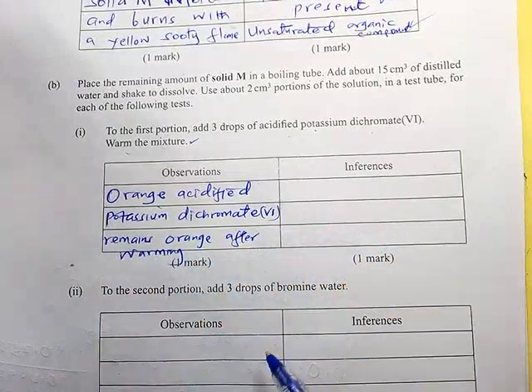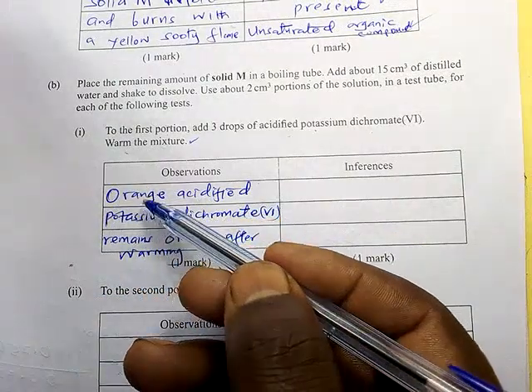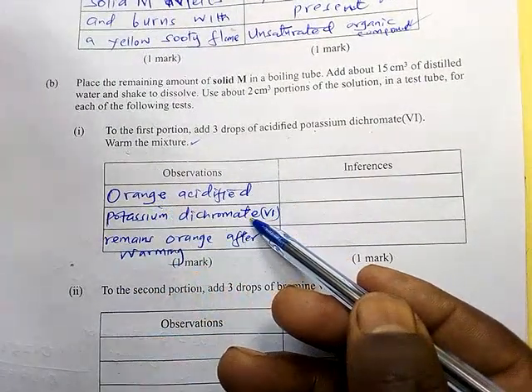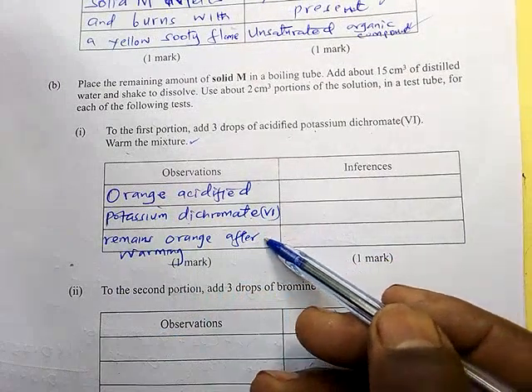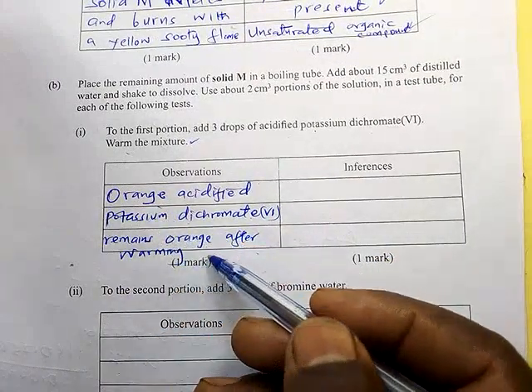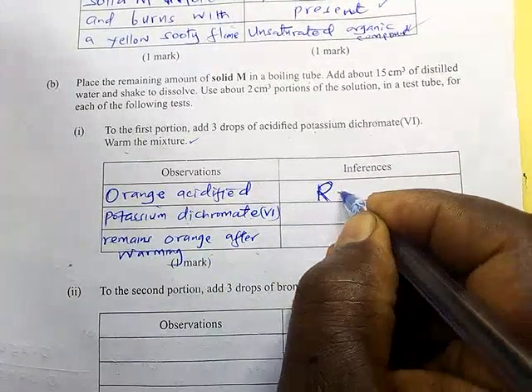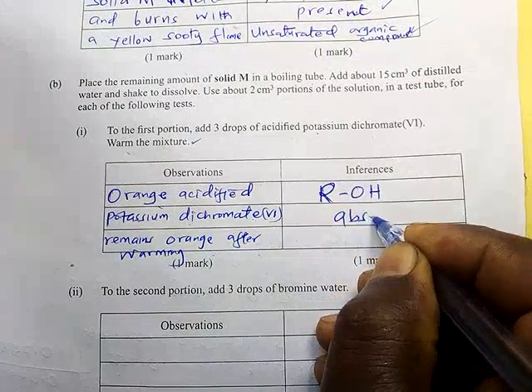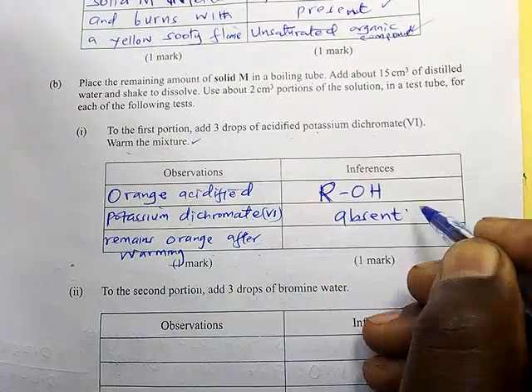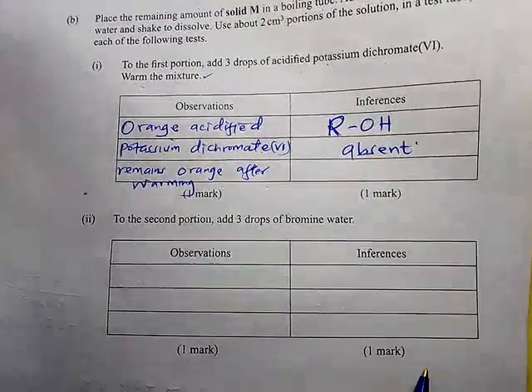So the color did not change. We expected it to change from orange to green, indicating that there is an alcohol. But it did not change, therefore it remained the same. It means that the alcohol was absent.